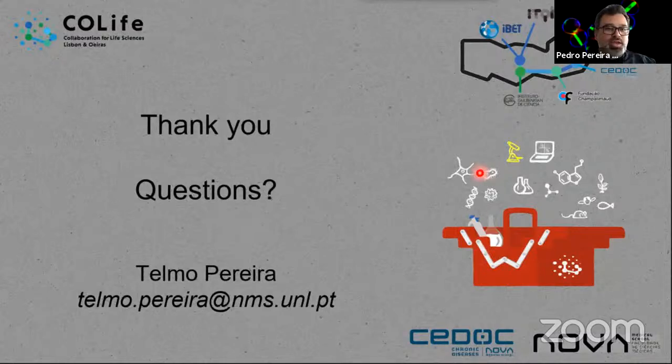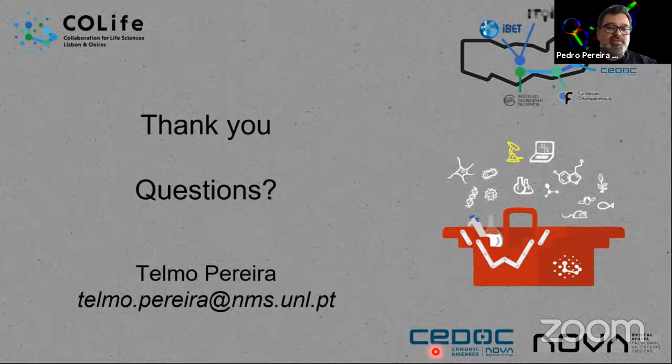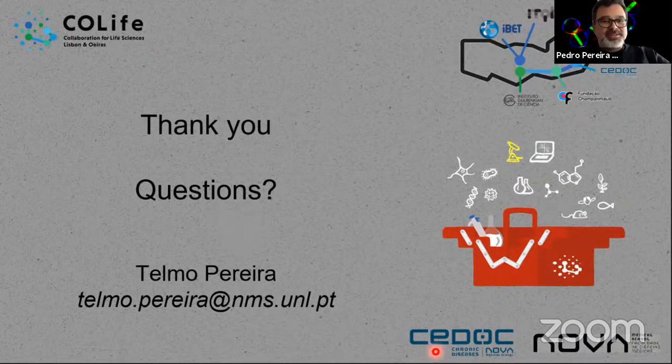Before we move into Rino, we do have one question from Aaron, which is a very good question. Aaron asks, let me guess, if we are unsure what camera we should use for our biological question, technique, Davide will tell us to contact our local facility head. I write this because I assume there is no rule we can use in camera selection. Is it correct? To select properly, we need to know a lot, which is why we have the microscopy community to help us. Exactly. Would you like to comment on that, Tom?